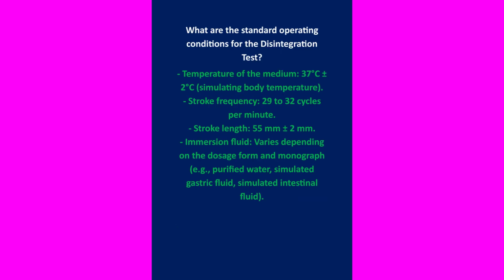Standard operating conditions for the disintegration test. Generally, temperature of the medium 37 plus or minus 2 degrees centigrade, simulating body temperature. Stroke frequency 29 to 32 cycles per minute. Stroke length 55 mm plus or minus 2 mm. Immersion fluid as per dosage form and as per monograph.